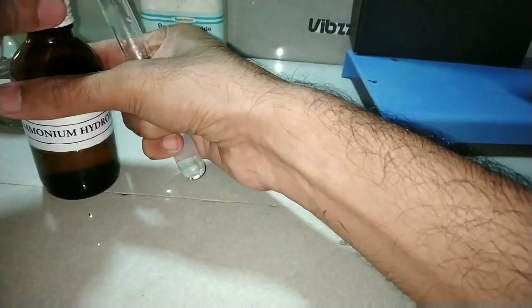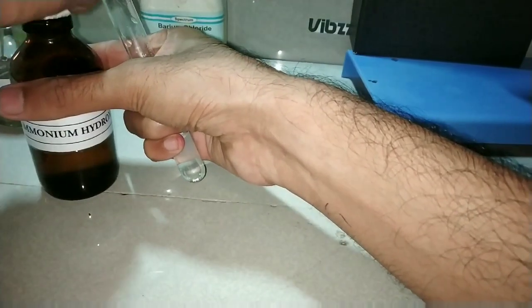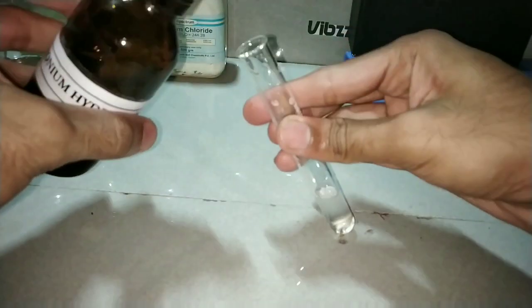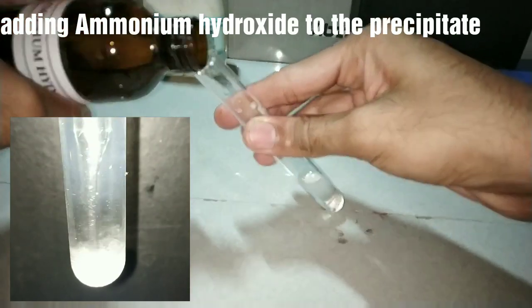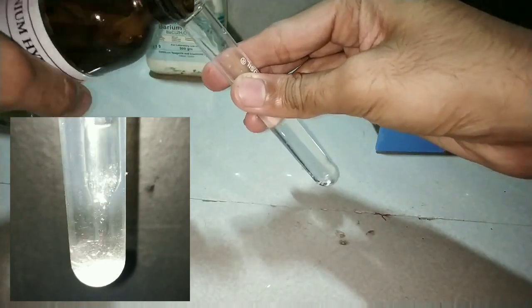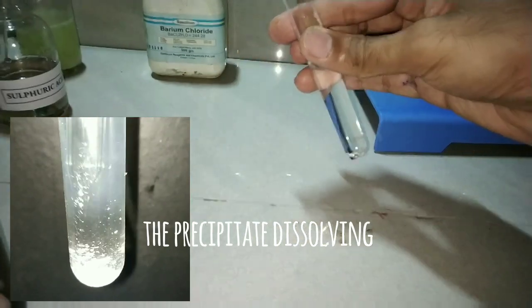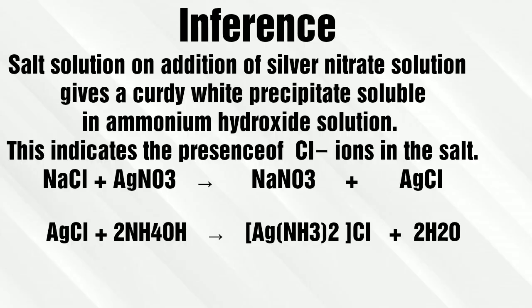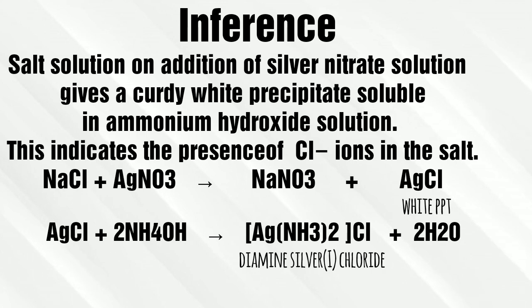The precipitate formed will dissolve in excess ammonium hydroxide. You should take care that ammonium hydroxide should always be in excess. Here I am adding about double the amount of the solution. You can see that immediately the precipitate dissolves. The white precipitate of silver chloride reacts with excess ammonium hydroxide to form diamine silver chloride, which is soluble in water.